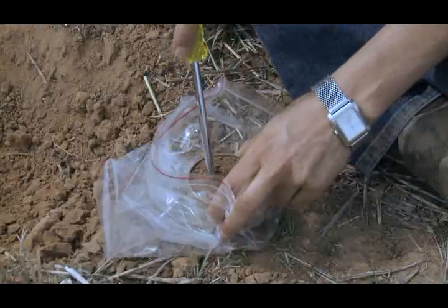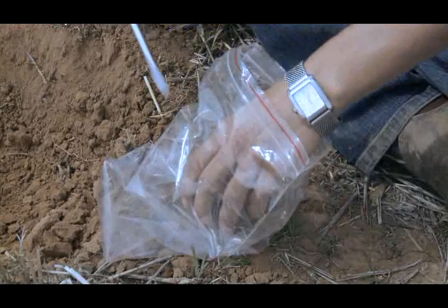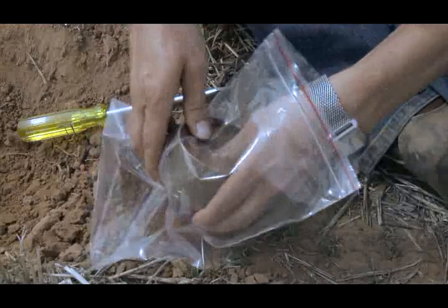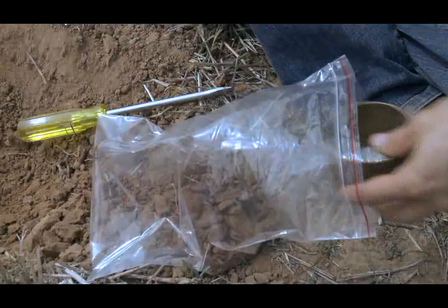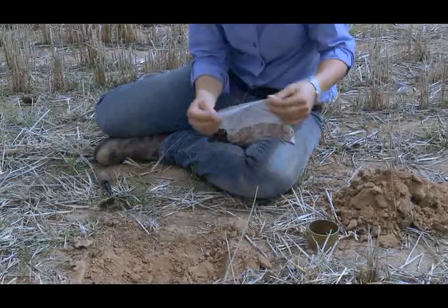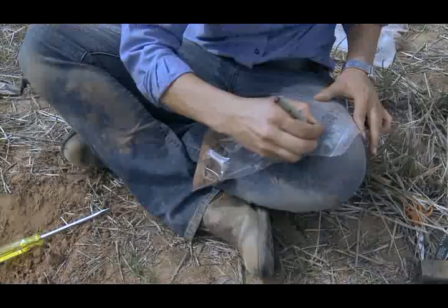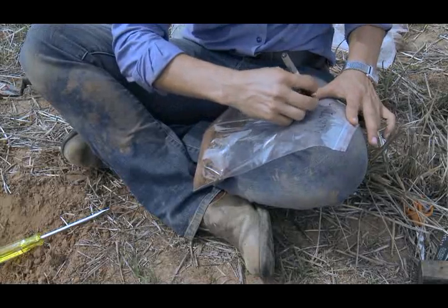Step 6. Put the soil core into a plastic bag. Step 7. Label the bag with bulk density, 0-5cm depth, and the identification of the transect line.